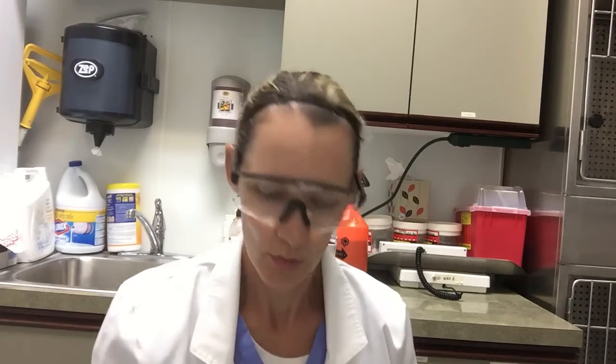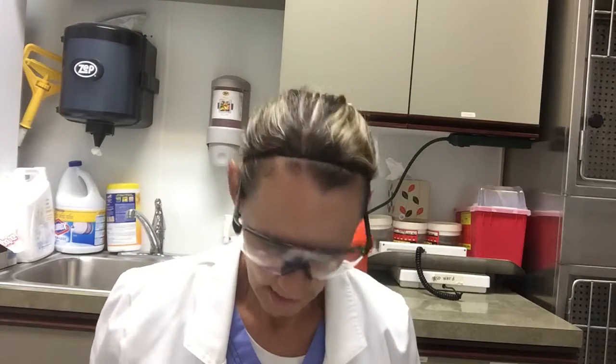Hi. Okay, so I have gone ahead and finished writing up my chart note that's going to go into Patriot's chart, and basically said that I did not see any casts or any crystals in the urine sediment that we looked at under the microscope. So that's ready to go into his chart.